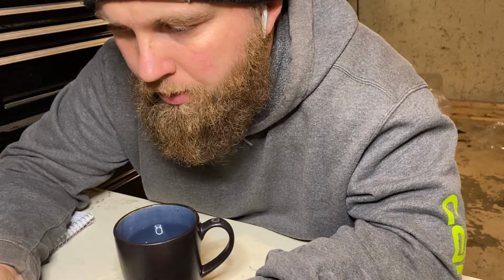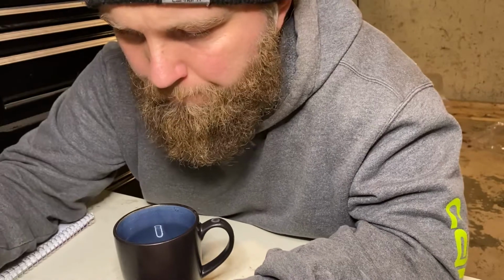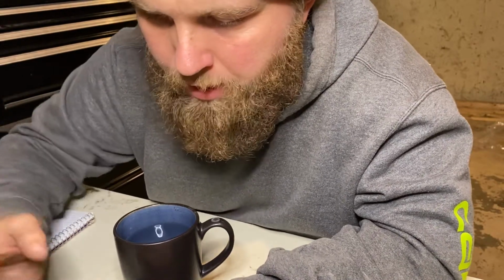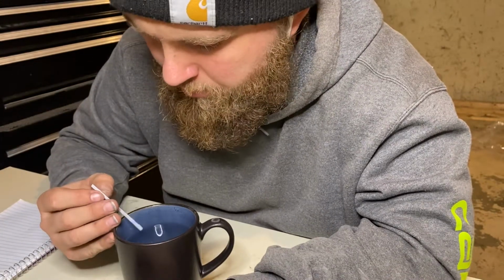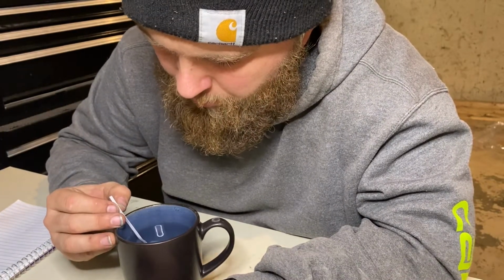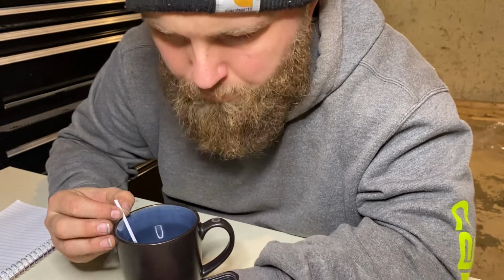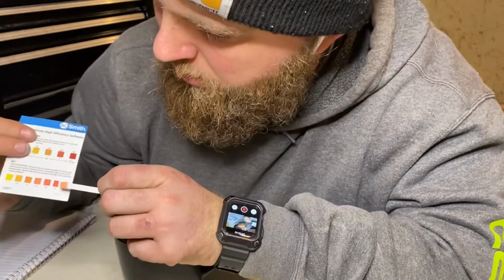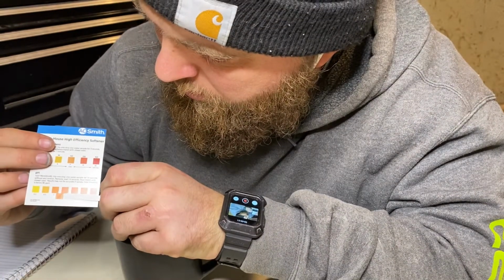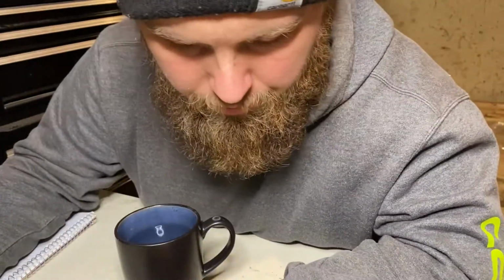All right. So I have a pH, and it said 15 seconds, right? No, 10 seconds without any motion. All right, yes, back to the Mississippi seconds. 1 Mississippi, 2 Mississippi, up to 10 Mississippi. All right, and then we'll, just like last time, go up to their little chart. Oh wait, no, I gotta wait 15 seconds.